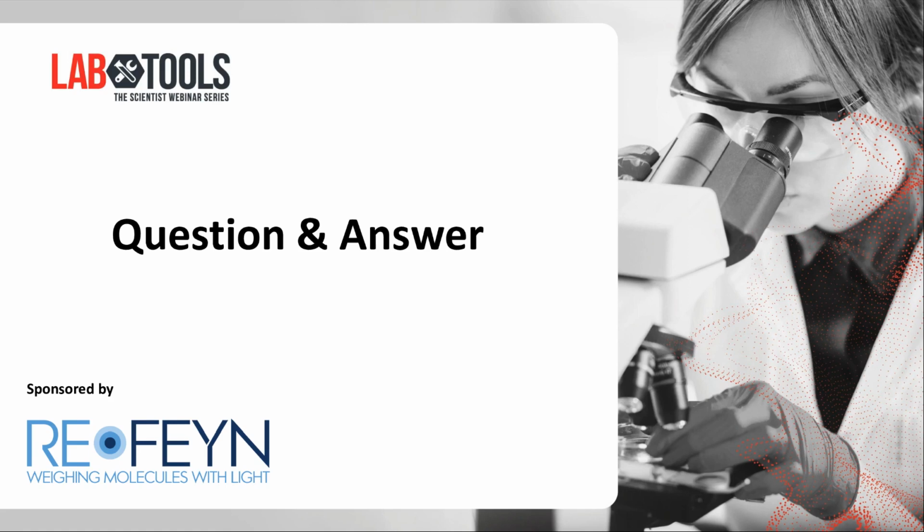I guess most lipid mixtures should be fine. If you can make a normal supported lipid bilayer for, for example, fluorescence measurements, you can definitely also do this for MSPT. But of course, there are tricks to some lipids, like for example PIP, where you need to ensure, for example, protonation just before adding them to the mixture so that they incorporate nicely. But in principle, every lipid mixture should be possible.